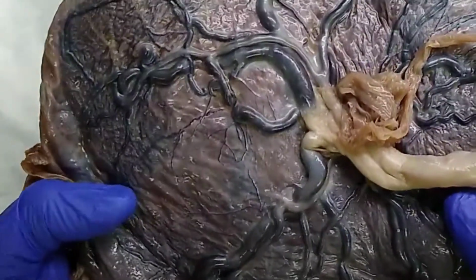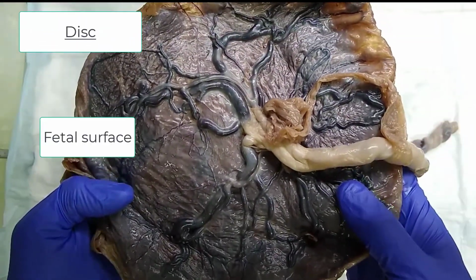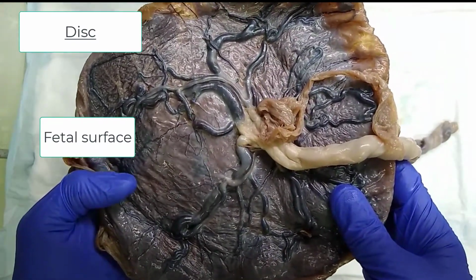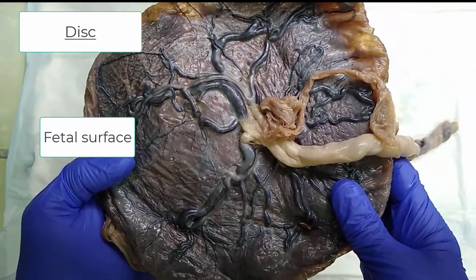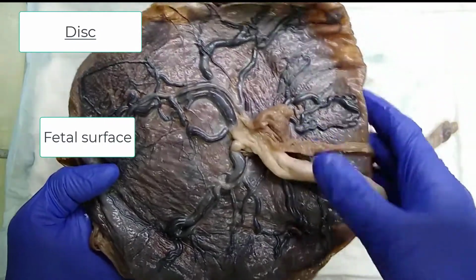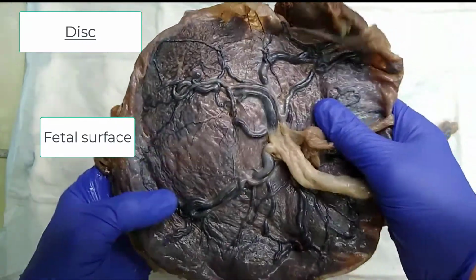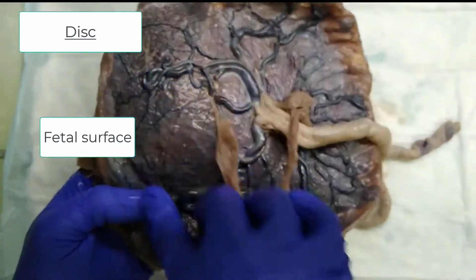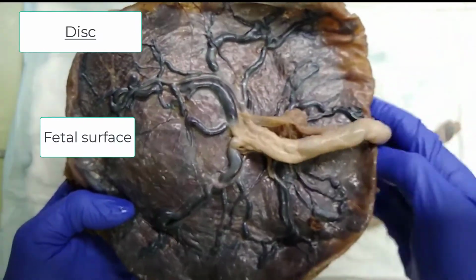The color of the fetal surface is usually blue-gray, and it's usually easy to see the vessels, but when there is acute inflammation, they can become obscured. The vessels usually run all the way to the edge of the disc in normal development.